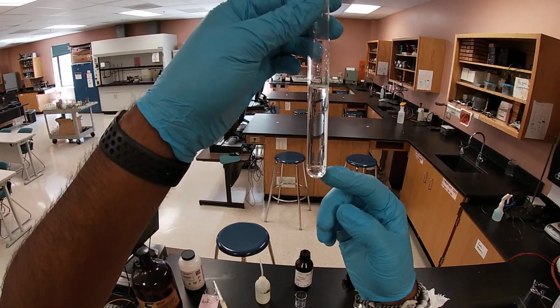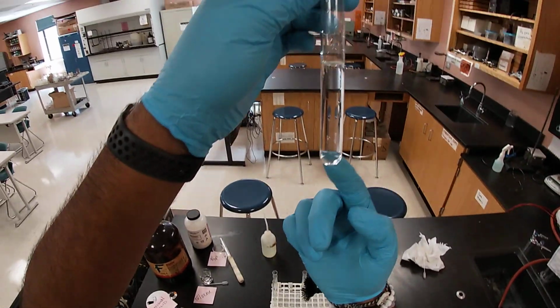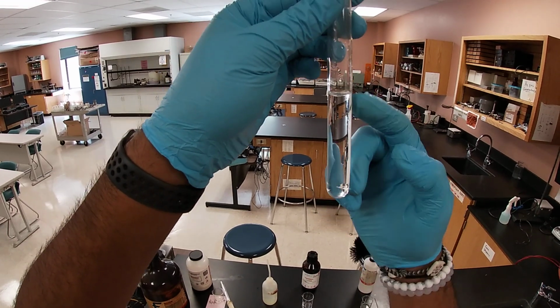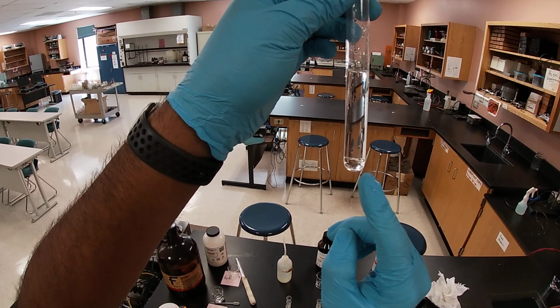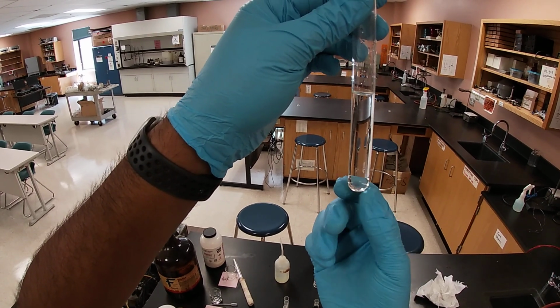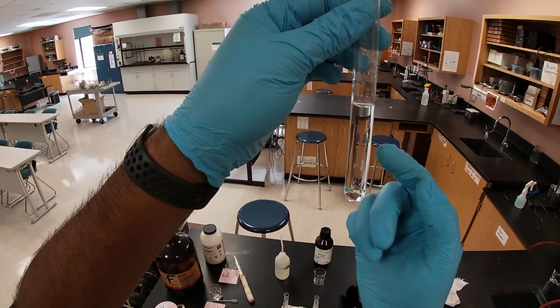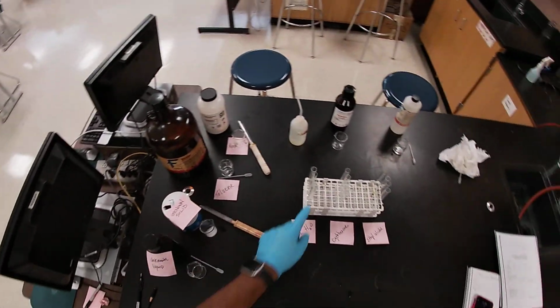So if you notice, there's a layer here at the bottom. It's kind of like a little glob. And then we have the big layer of water. So that means that whatever liquid this is is also non-soluble in water. But if you notice, it's at the base. So that means that this one is more dense than water. Okay, so whatever the unknown liquid is, it's not soluble in water.